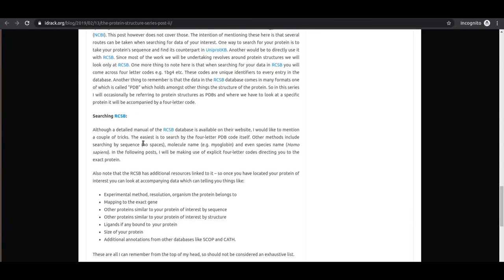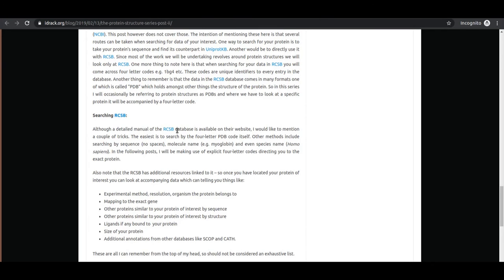There are different ways to search the protein database. We have used sequence-based search and PDB code search, but you can also search by gene name, by proteins similar in sequence or structure, by ligands, by protein size, and using SCOP and CATH annotations — additional databases whose annotations are also present and searchable in RCSB.